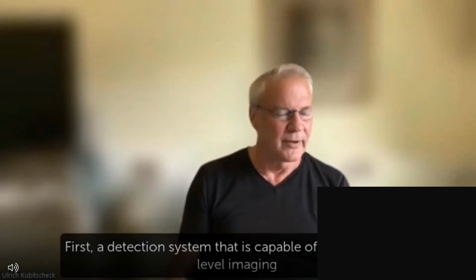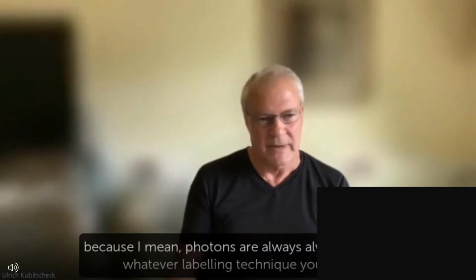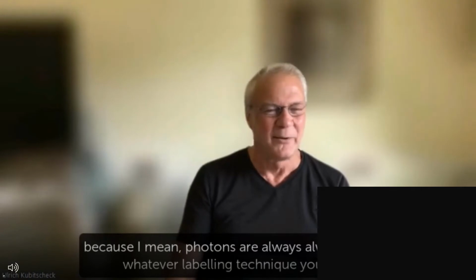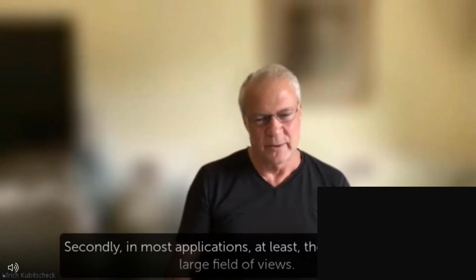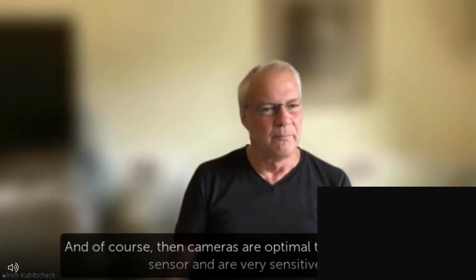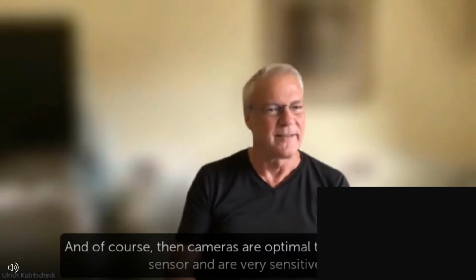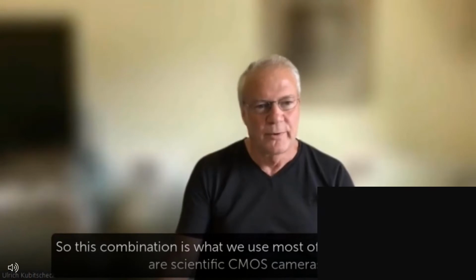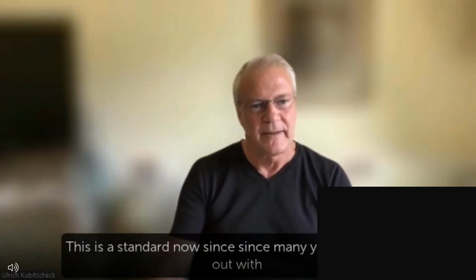First, a detection system that is capable of really low light level imaging, because photons are always limited, whatever labeling technique you use. And secondly, in most applications, at least, we really require large fields of view. And of course, then cameras are optimal that have a large sensor and are very sensitive. So this combination is what we use most often. What we use are scientific sCMOS cameras. This is a standard now since many years.